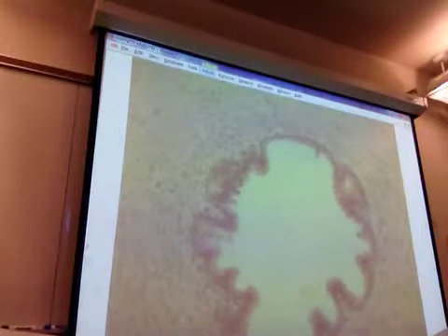As far as a sperm slide, you have the acrosomal head, the head. Do you want to see the sperm slide? There's even sperm on that one right there, where we just looked at it. Well, there was, but I'll show you the actual sperm slide.